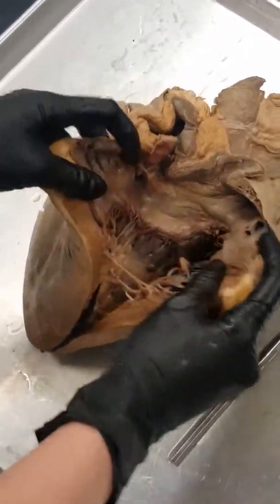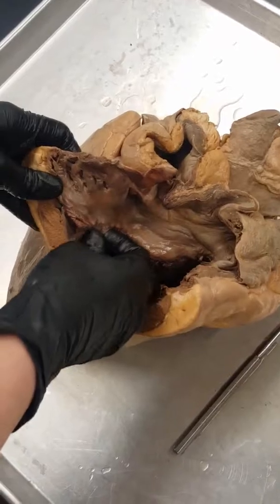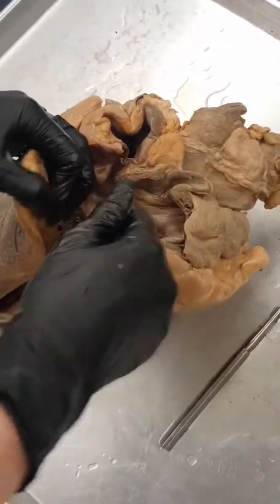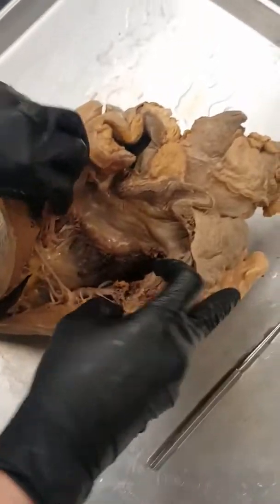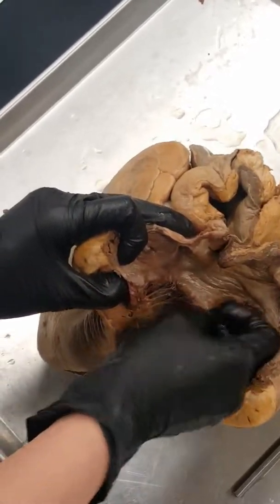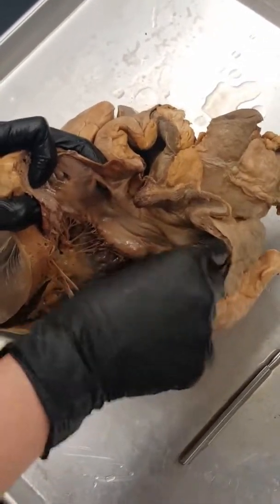Outside of that, that's pretty much the front and the inner of our heart. You can see how smooth this is on the inside — that's the endocardium, and that's basically so your blood doesn't have any friction when it's trying to flow in and out. The outside is going to be the myocardium — these kind of meaty portions that you're seeing.